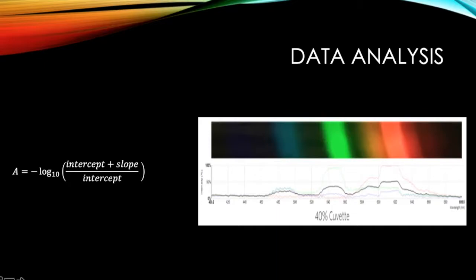Plots were created to compare concentration versus relative intensity, and a linear regression was run where the slope represents the total drop in intensity across the experiments, and the intercept is the initial incident value. Standard error of these datasets was also calculated and are the assumed uncertainties. R and R squared values were collected as well at this point to assess the goodness of fit. We used the equation listed on the screen to model the absorbance that was discussed in the background.